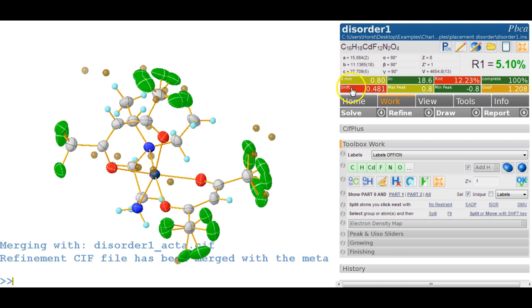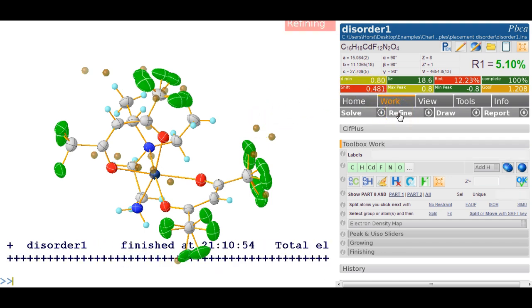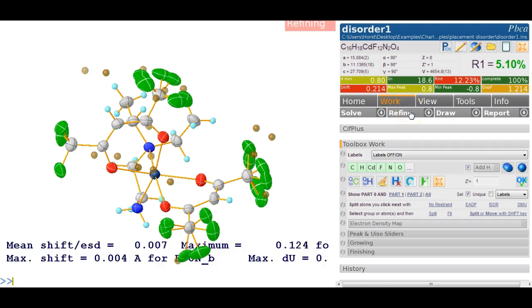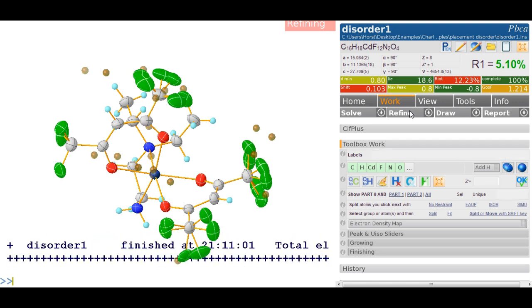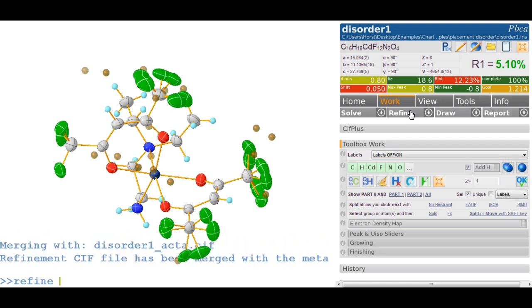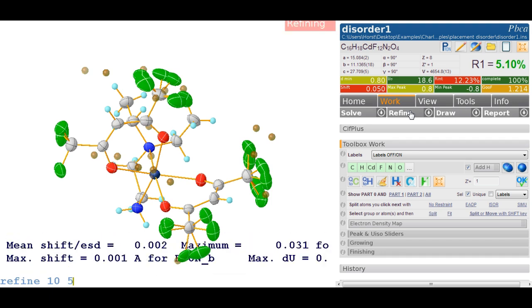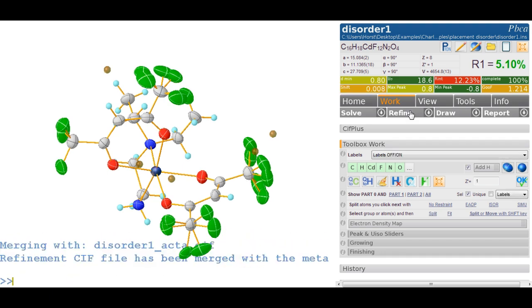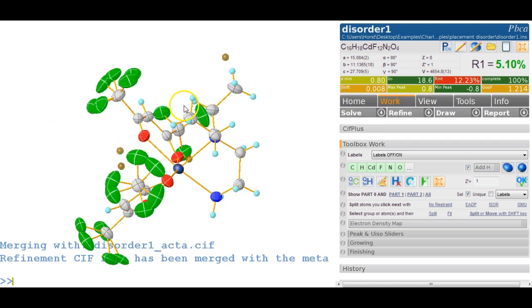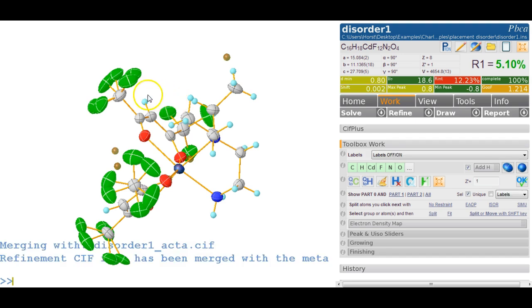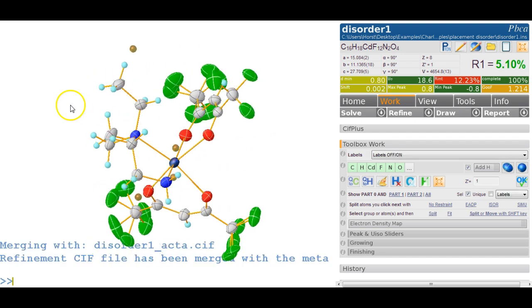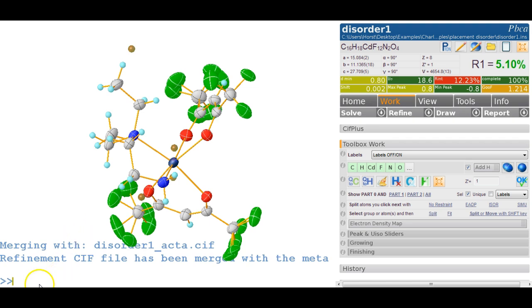We're not quite finished - it's still wobbling, so we refine some more making sure the shift settles to zero. We can increase the number of cycles with 'refine 10' showing only five peaks since we've found everything of interest. The biggest peak is 0.8, which we can live with. After a final Control-R, it's nicely settled and the disorder has been modeled. Thank you for using OLEX2.